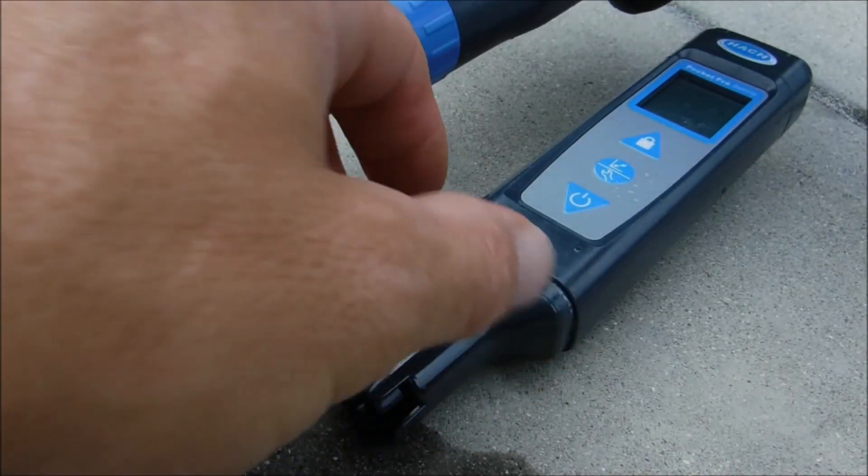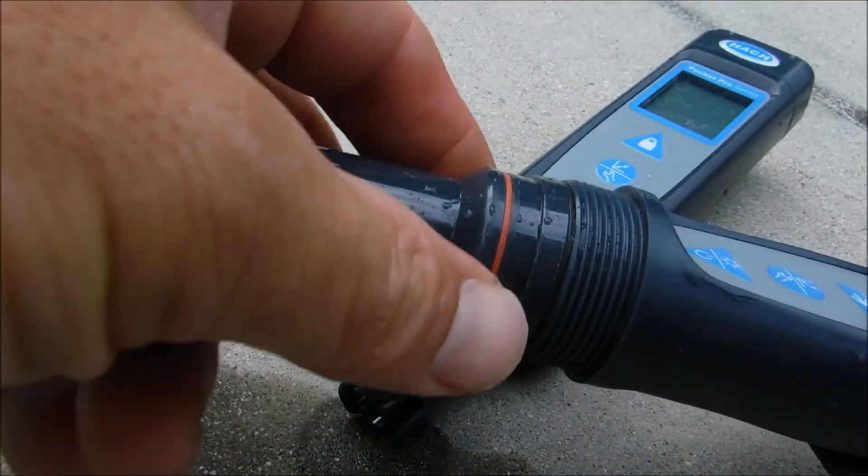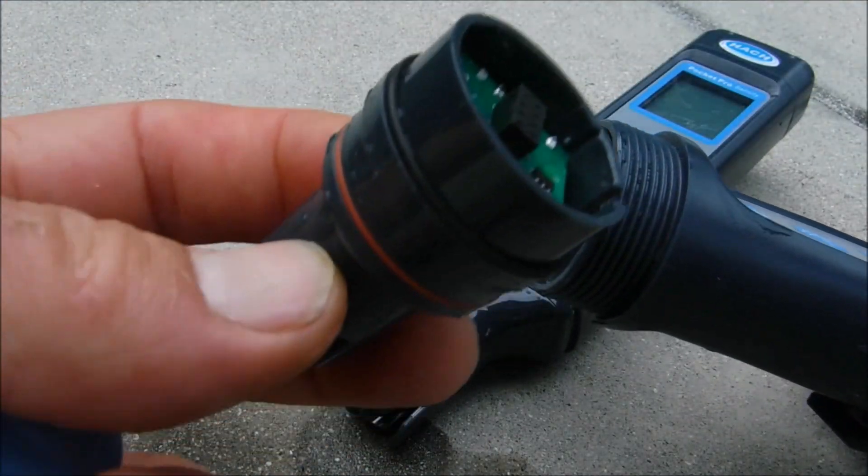The standard Pocket Pro doesn't have a replaceable sensor, but the Pocket Pro Plus does. You can just unscrew it here, and when the sensor goes bad you can pull it off and insert a new one.